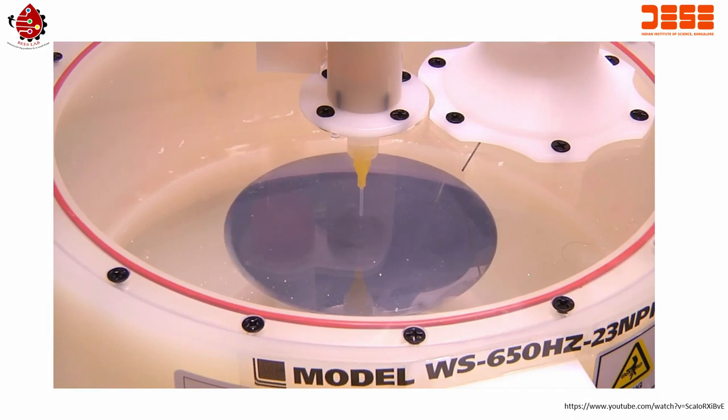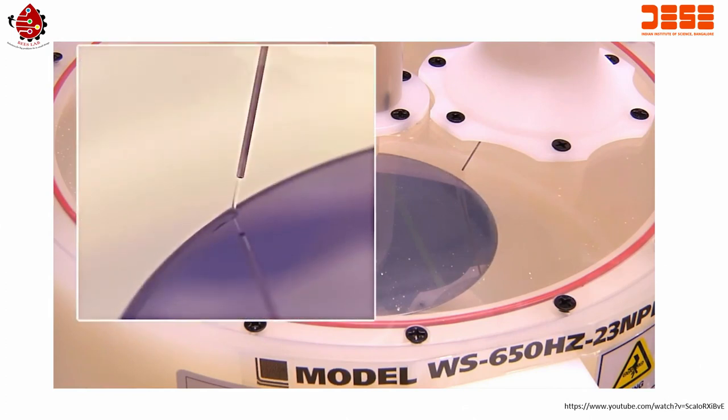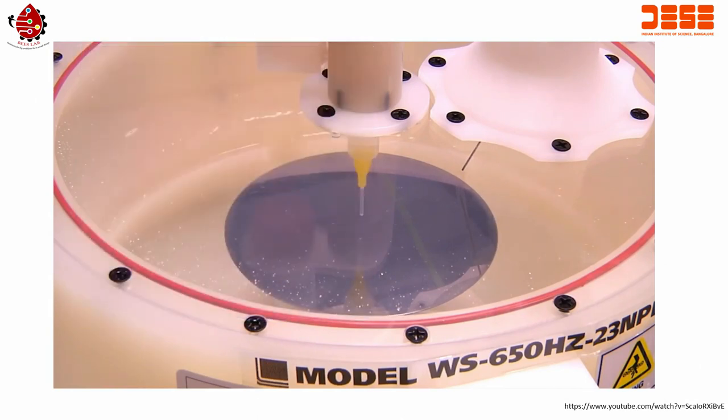The center universal dispenser delivers the coating material, and the substrate is accelerated to the final speed needed to achieve the required film thickness and dry the substrate. The substrate is slowed to around 1000 RPM, and the solvent is dispensed for 3 seconds, removing the edge bead. The substrate is then accelerated to 3000 RPM to dry the edge.